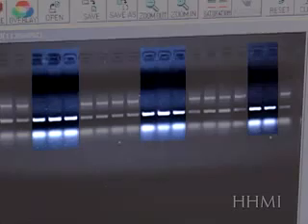This represents a transgene, which is only present in some lanes. The lanes with both normal gene and transgene represent transgenic mice. The lanes with only the normal gene represent mice where the transgene did not successfully incorporate into the genome.